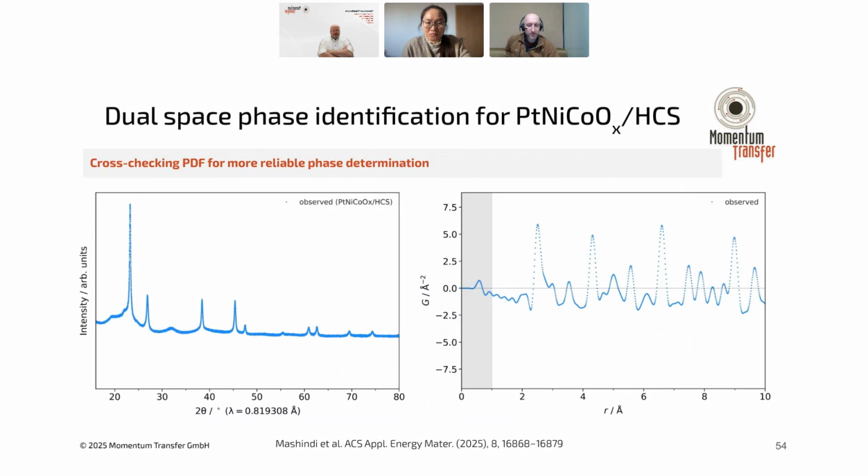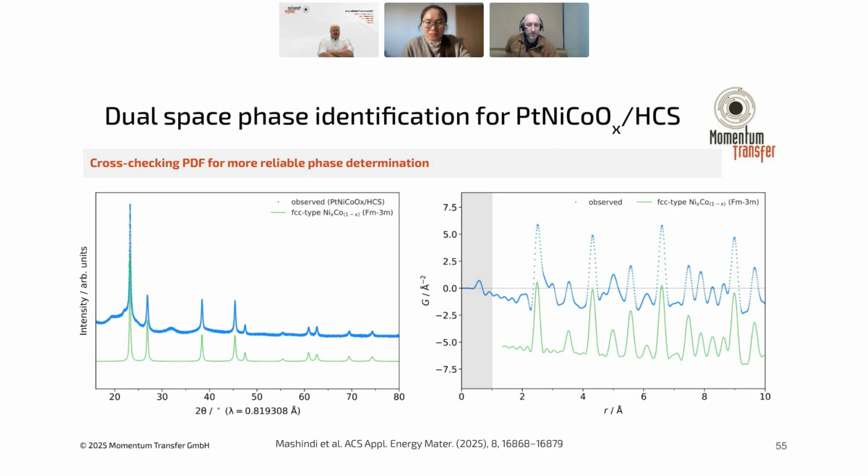complicated, actually. We see, okay, there's metallic nickel cobalt, actually more substantial than in the previous cases, and definitely larger domain size. But now we have to really use some additional information to figure out the rest of this, right? So fortunately, we have lots of pre-knowledge here, so we can guess again that there's this sodium chloride type nickel cobalt oxide. That would be relatively difficult to assess without any other information, but we expect it to be there. But where's the platinum going?